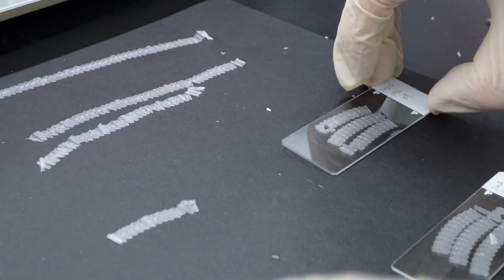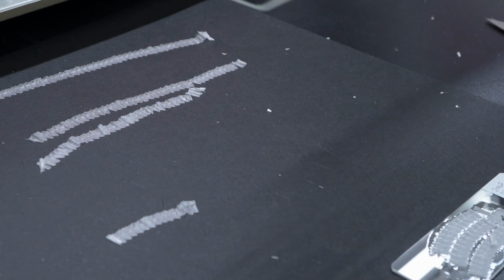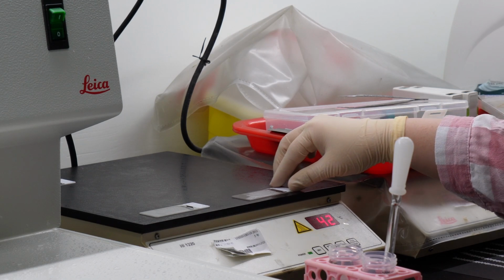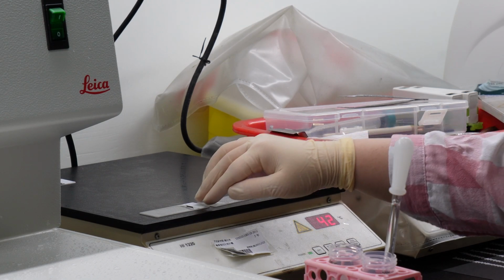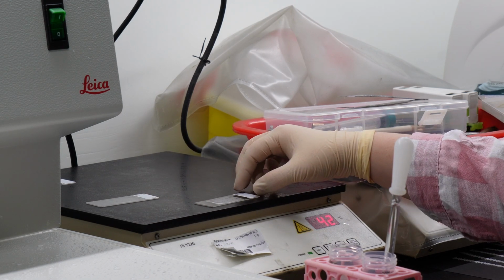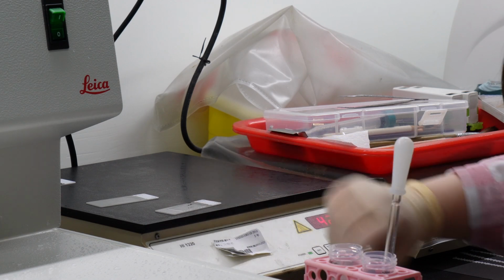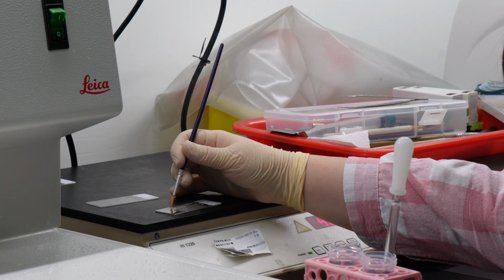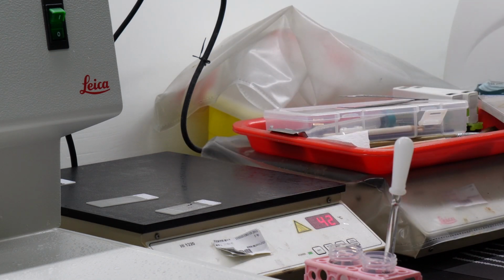Carefully. You typically float the ribbon onto the surface of a warm water bath. The warmth helps relax the paraffin and flatten the ribbon out perfectly, removing any wrinkles from cutting. Right. Then you carefully bring a clean glass microscope slide up underneath the floating ribbon and lift it straight out of the water. You want the ribbon aligned nicely on the slide. It takes practice. I bet.